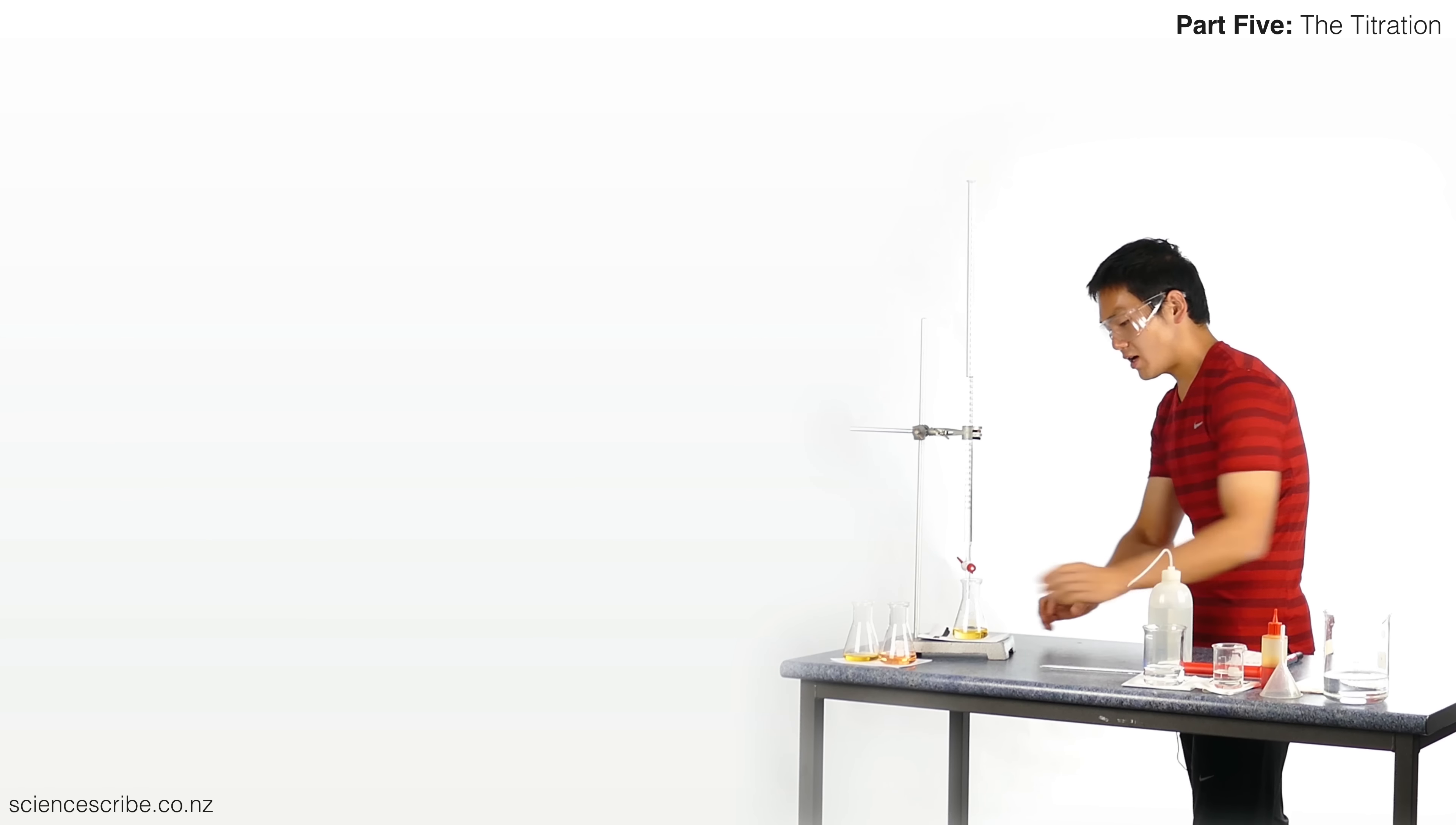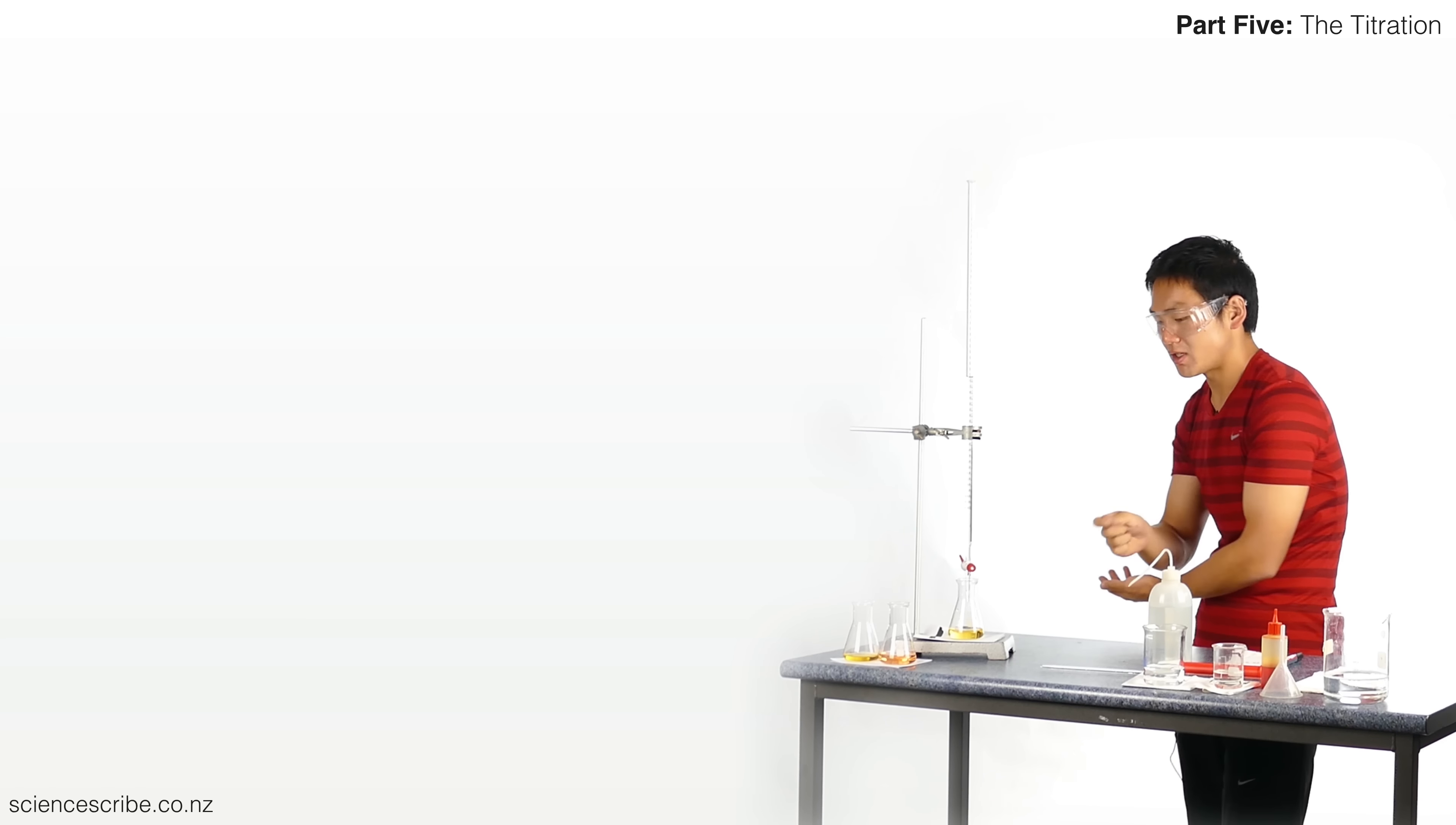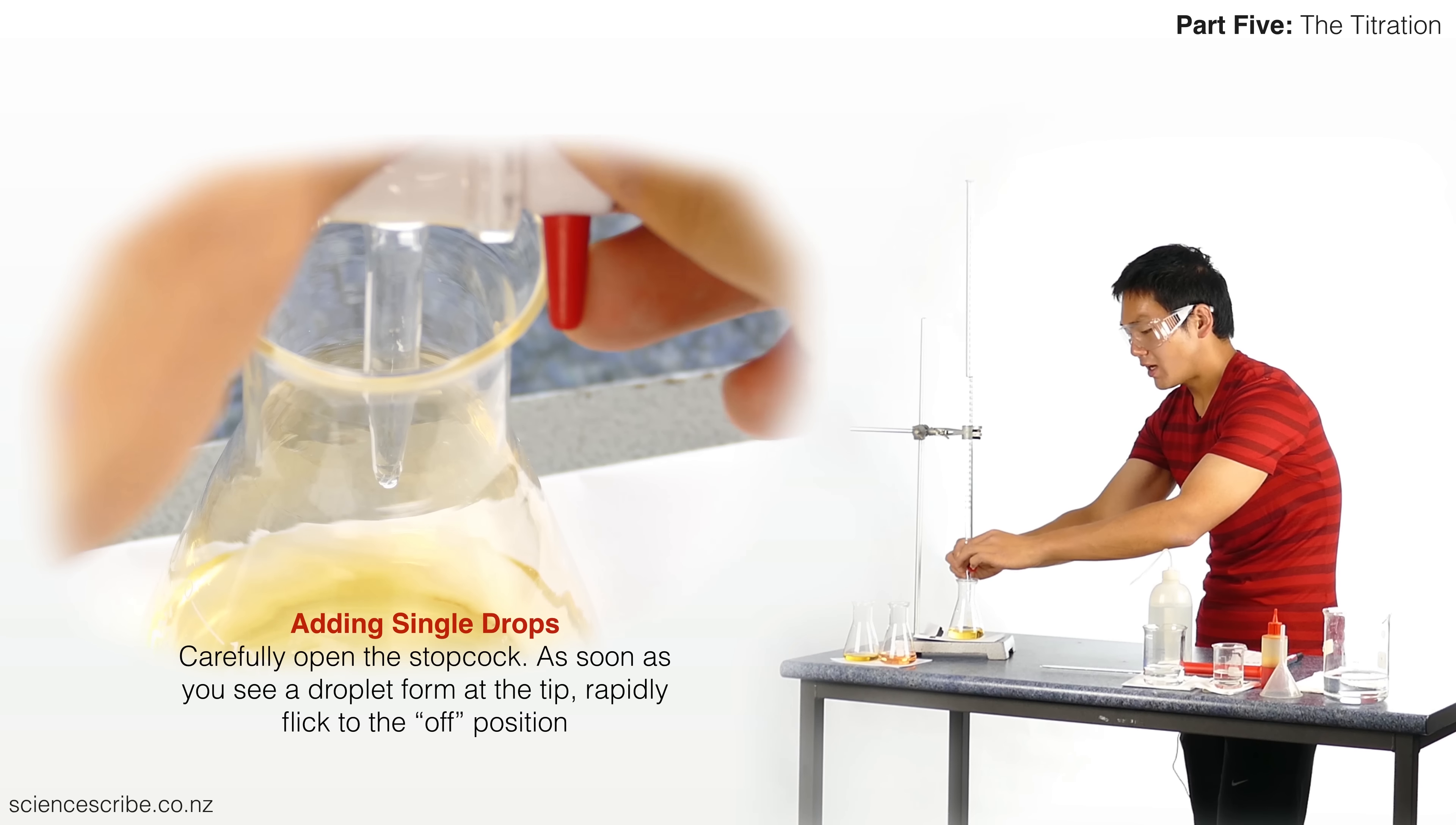Okay, looks like that half drop wasn't enough to turn that on the peachy side. Let's go ahead and add one more drop. I want to be careful to add a single drop. What I do is turn the stopcock, and when these handles get closer and closer to the vertical position, that's when I want to slow down the turning process, because that's how I get single drops hanging off at the end. When that drop forms at the end of the burette, then I'm going to turn my burette to the off position very quickly, and that will give me a single drop. If I then repeat the process, I can get that single drop to fall. Now this takes some practice, so I hope that none of you guys watching at home have been skipping out on classes.